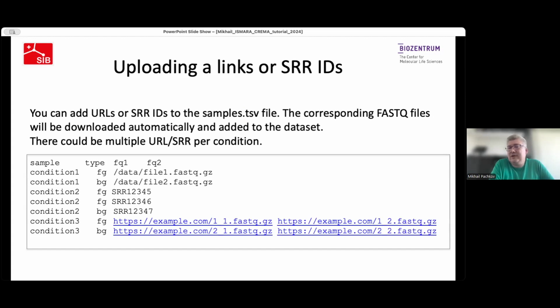Along with uploading real files, CREMA also accepts database IDs and links, and it is all done using this samples TSV file. So instead of file paths in this file, you can actually give, for example, an SRA ID, like it's shown here. Again, you shouldn't worry about this: if this is single-end data, it will be automatically recognized. If it's paired-end data, it's also going to be automatically recognized.